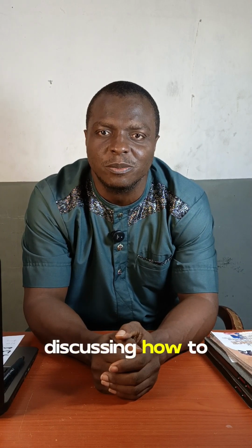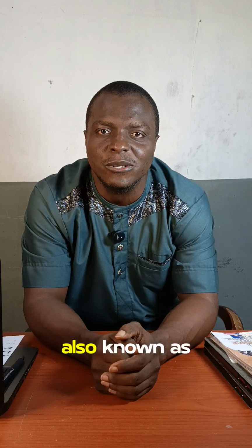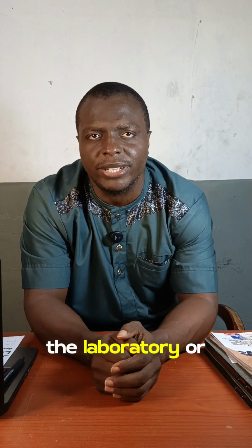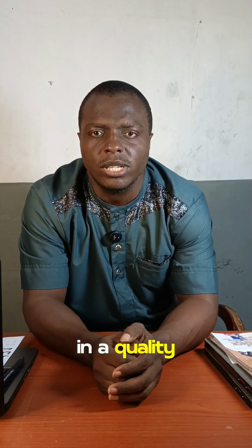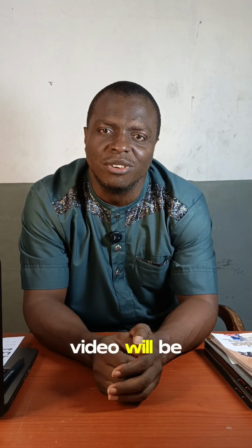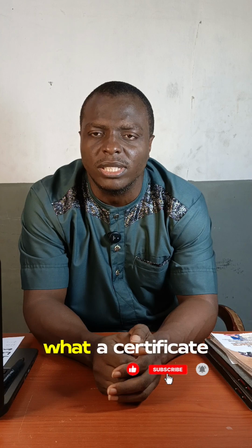Today we'll be discussing how to prepare a certificate of analysis, also known as COA. If you work in the laboratory, in a quality control unit, in a water treatment plant, in a pharmaceutical and beverage industry, or in a chemical production industry, this video will be of great importance to you. By the end of today's video, you will understand what a certificate of analysis is and how to prepare a correct one. First of all, what is a certificate of analysis?